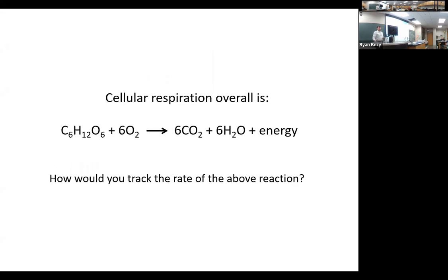Okay. All right, cellular respiration, we're looking at today. Again, this is the overall summary rate. How would you track the rate of this reaction? What are we going to be looking at today? Yeah, we're going to be looking at CO2 release. So if you look at your sensors out today, they're CO2 sensors. Just like we've been tracking oxygen percentage previously, now we're going to be tracking carbon dioxide production over time. We're looking at the appearance of one of the products over time from this process.